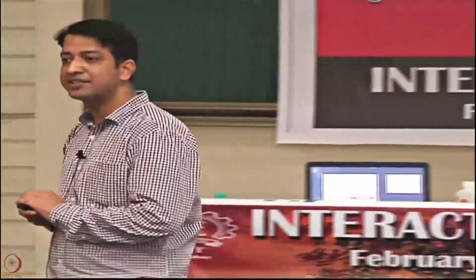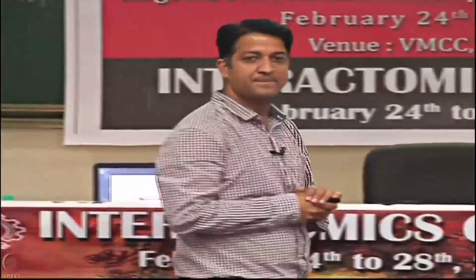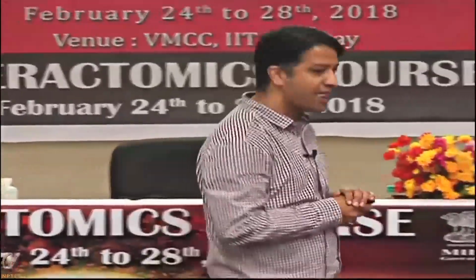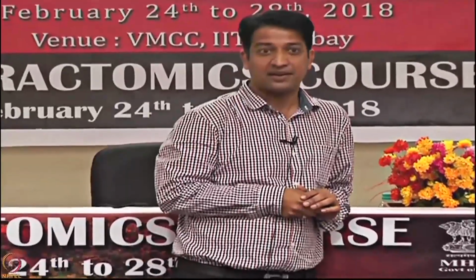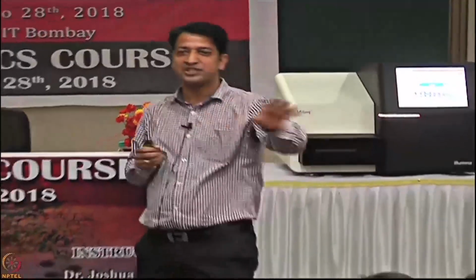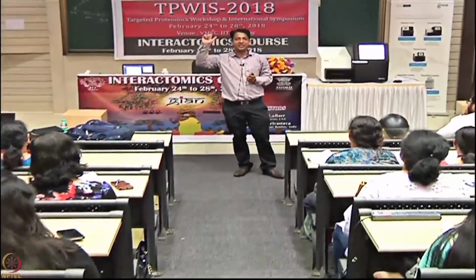Great. The right answer is throughput. Any idea how long the first human genome took to get sequenced? It took 10 years, and almost $3 billion was invested for the first human genome to be sequenced. So, what is the length of the human genome? It's a common question in CSIR NET, I guess, for those who appeared in the net. I hope you are writing. It's 3 billion base pairs, 3 into 10 to the power 9.